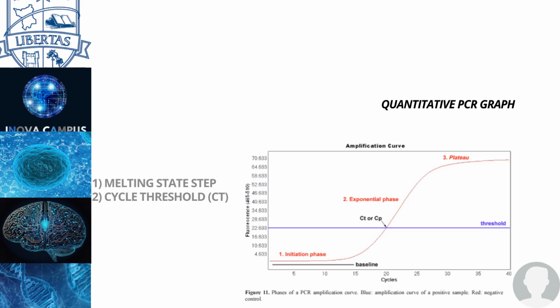But what kind of peak is that, and when do I see that the concentration is actually relevant for my study, for my research? So there are a couple things that you need to look at in the graph and recognize.